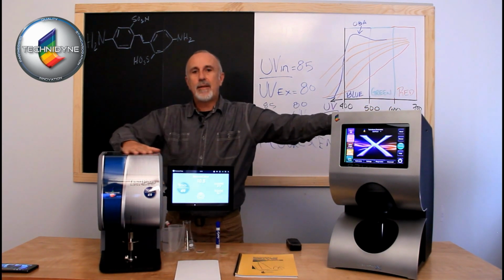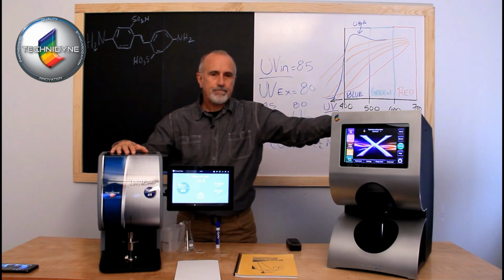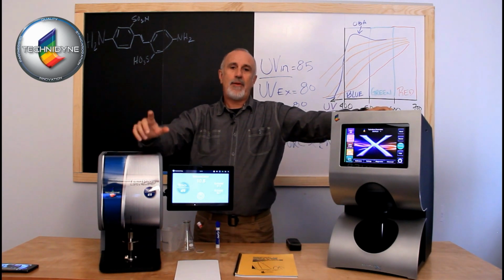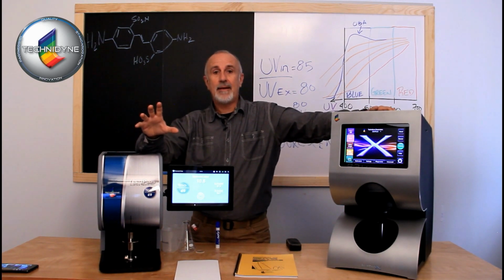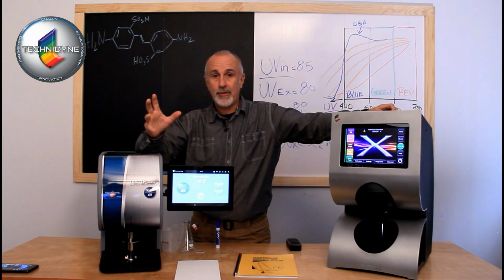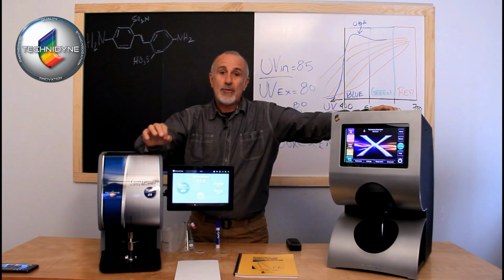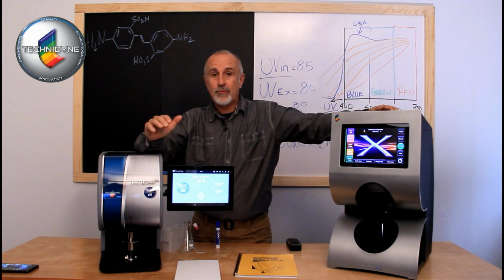So anyway, that was kind of where the industry was going with things. And then we introduced this concept of a xenon flash lamp. Now, a xenon flash lamp is a high-intensity light source similar to what you might have on your camera. Okay, so a very bright, intense light source. That light source also is very high in ultraviolet energy.